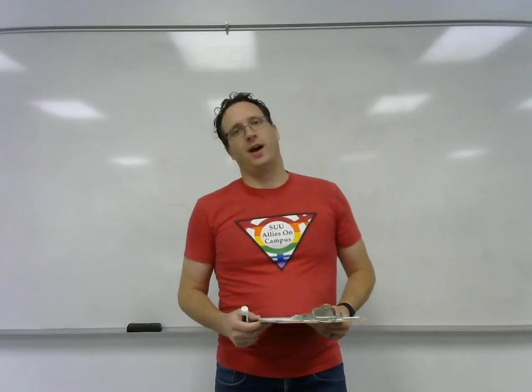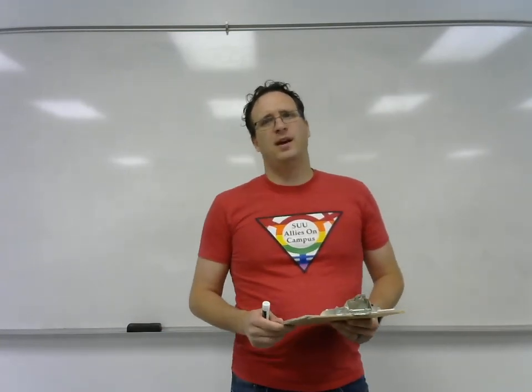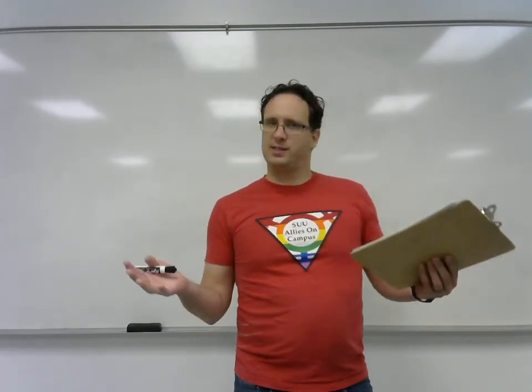Okay, welcome to the freezing point depression lab for Chem 1225. This lab is one of the simpler ones. The equations that we're going to be dealing with are really simple, but in this introduction I will go into a little bit more depth than you really need, just because I think it makes the lab more interesting if you understand why things are happening the way they are happening.